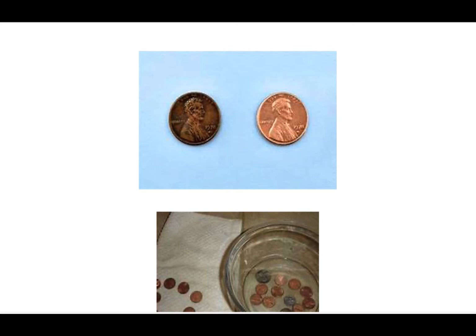All right, so I'm going to just very briefly go through some of the highlights from the Penny lab. In this lab, you were able to see both synthesis and single replacement, and also double replacement, actually. I didn't ask you to address double replacement in the lab because we hadn't gone through double replacement, but I'm going to explain what's happening in just a second.